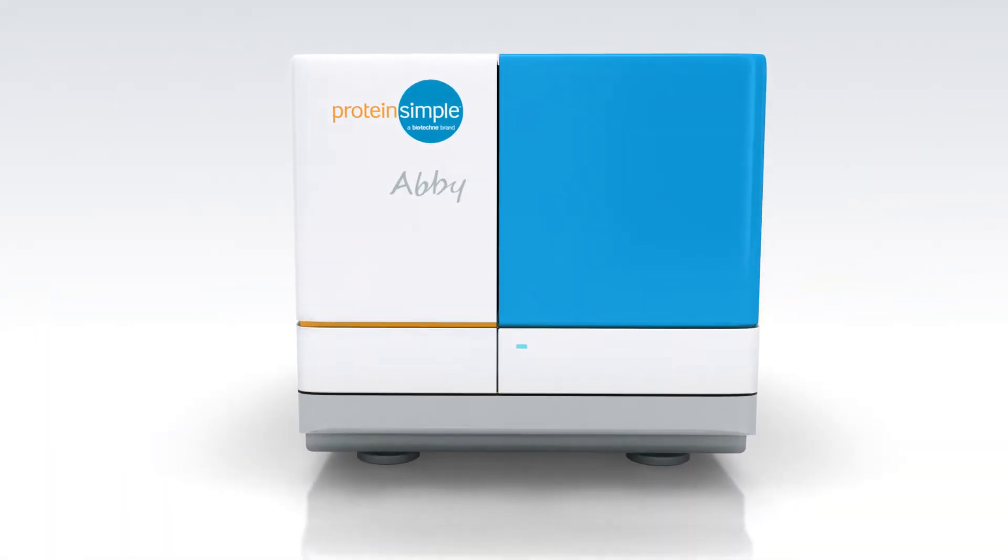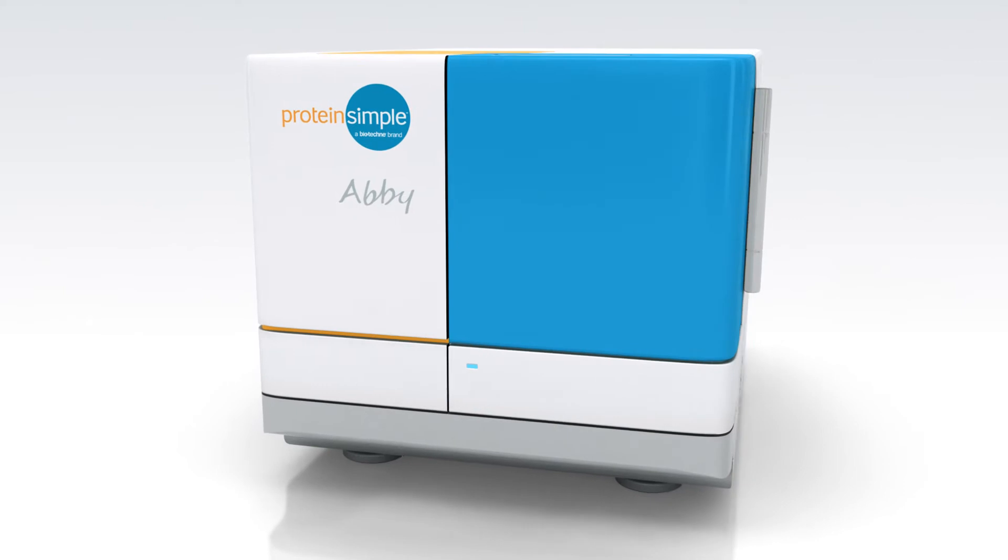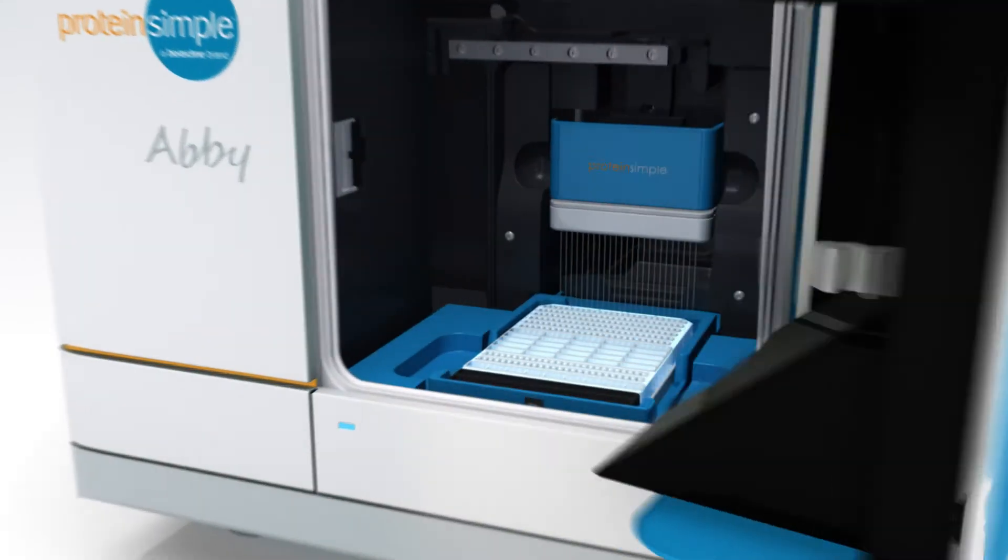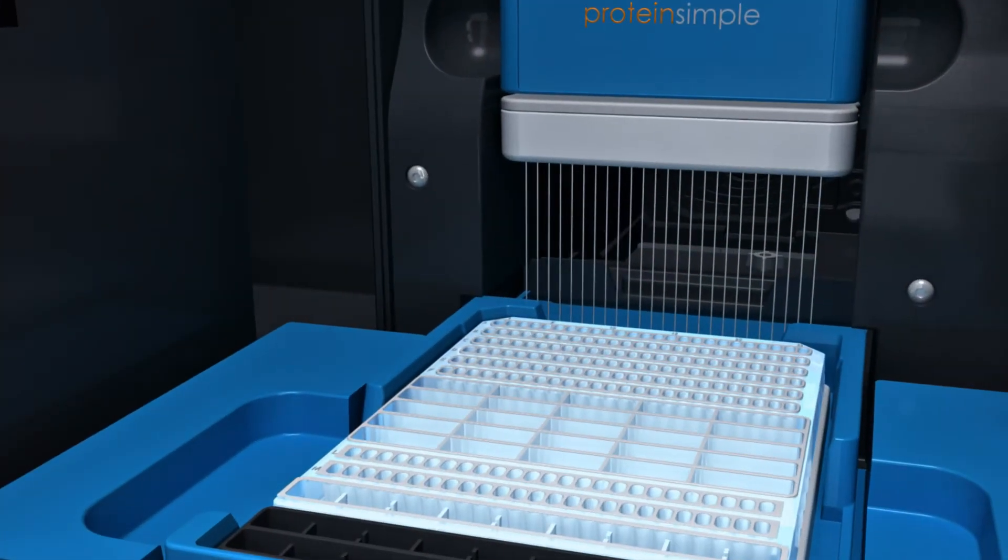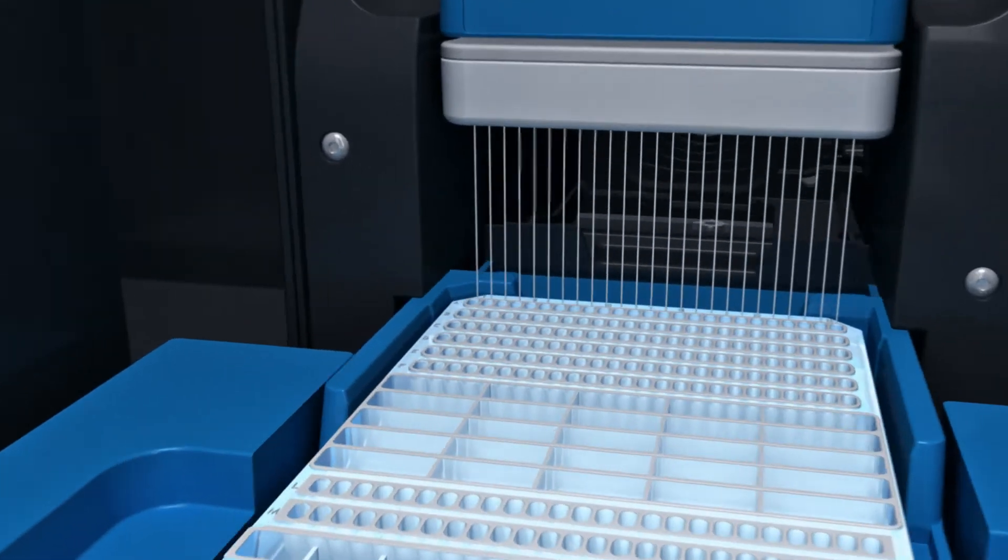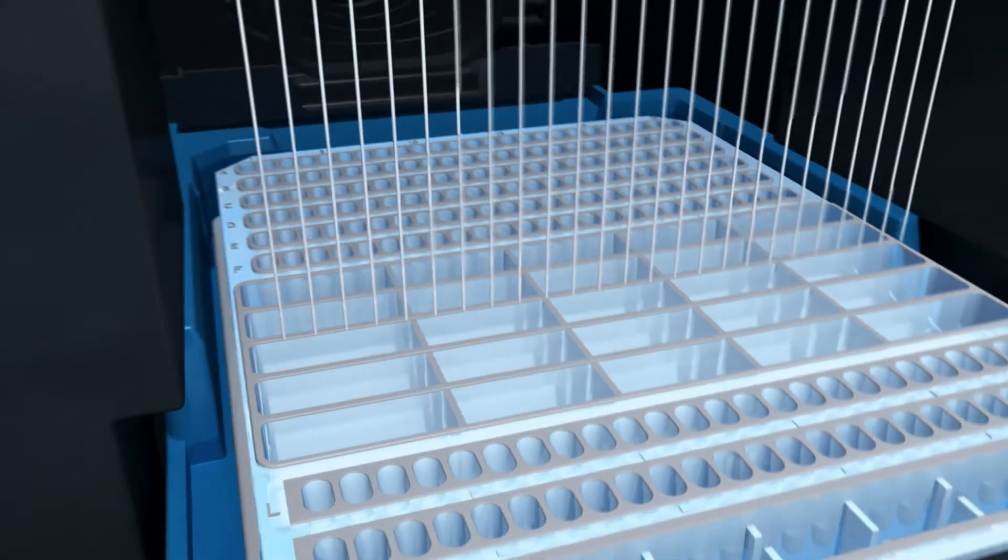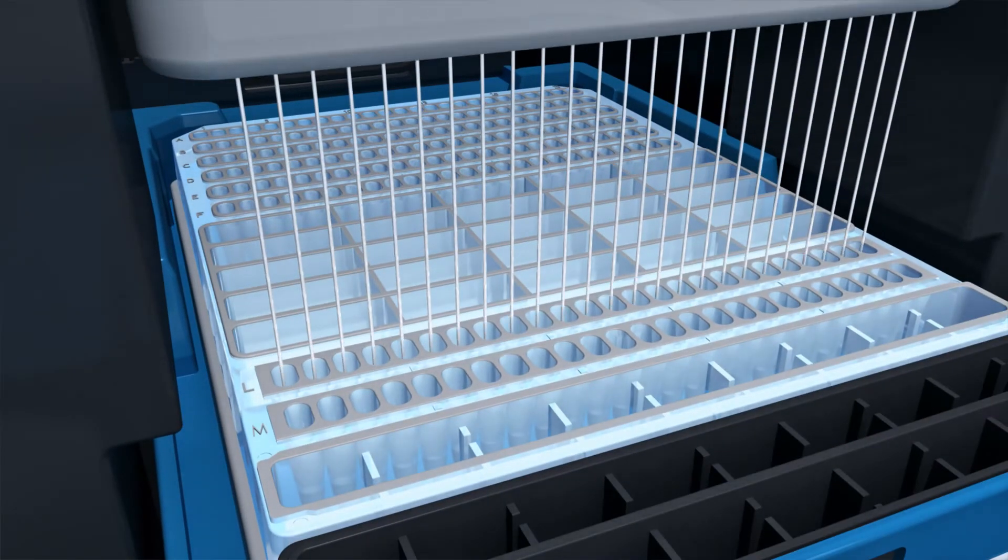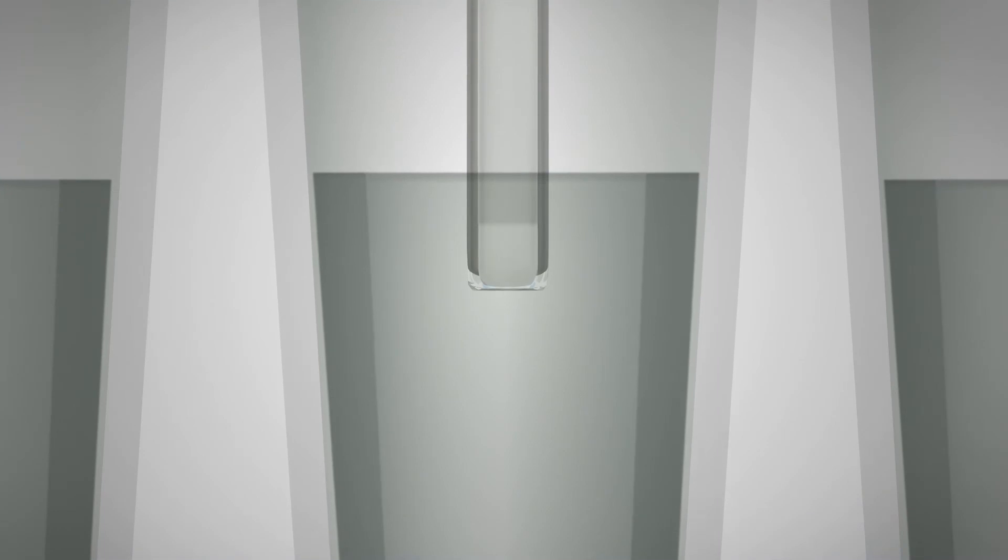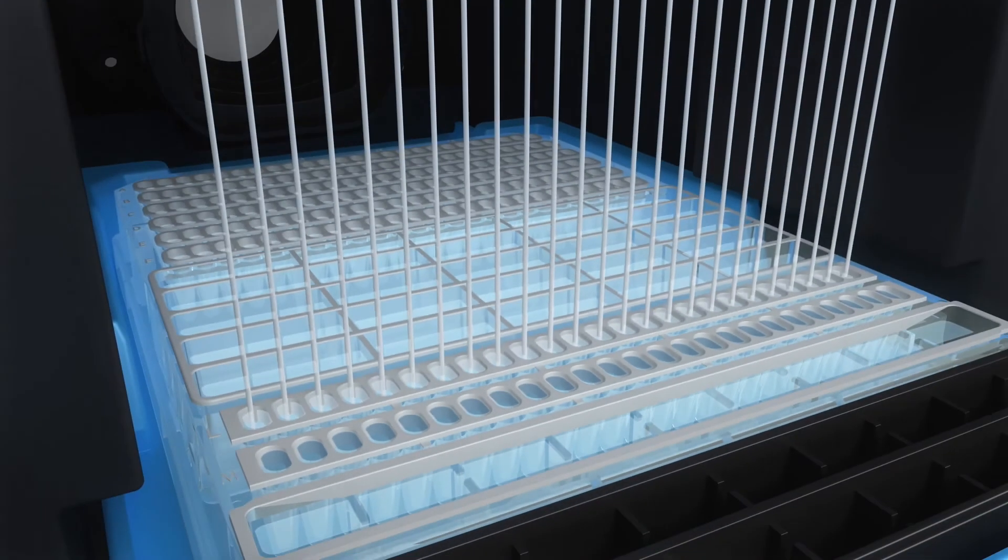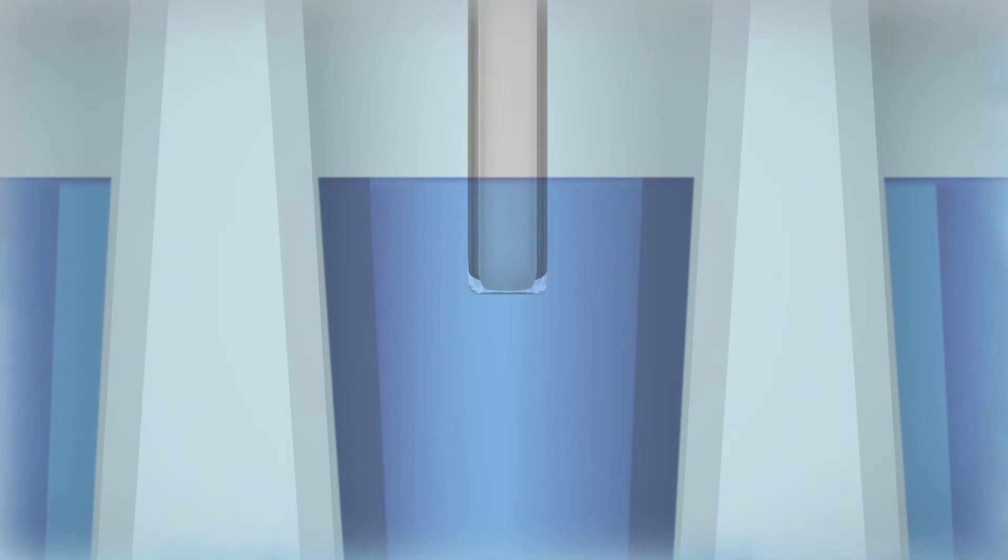Simple Western immunoassays take place in a capillary. Your sample, separation matrix, stacking matrix, antibodies, and reagents are loaded automatically from a specially designed plate. Abby begins by aspirating the separation matrix and then the stacking matrix into each capillary.